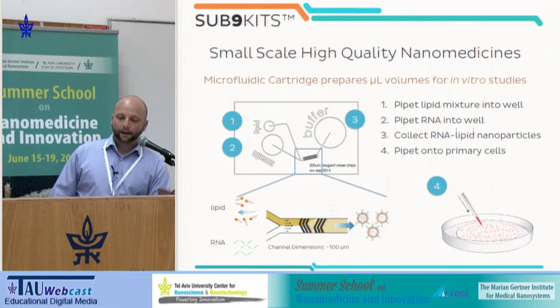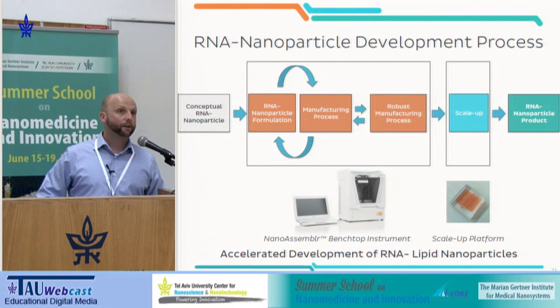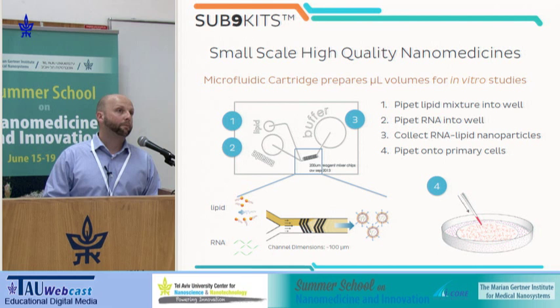Now, I think I have quite a bit of time. I'll probably be fairly short in my talk. But I'm going to spend a little bit more time talking about the types of nanoparticles that you'll make in the workshop tomorrow. These are the siRNA LNP systems. But I also wanted to highlight a little bit this new technology we developed, which is for very small scale manufacturing of high quality nanomedicines.